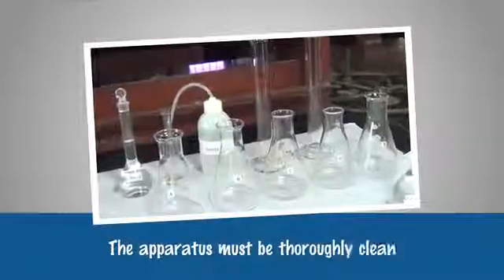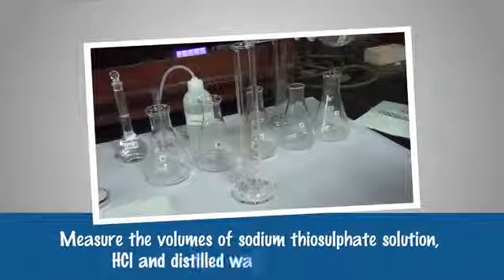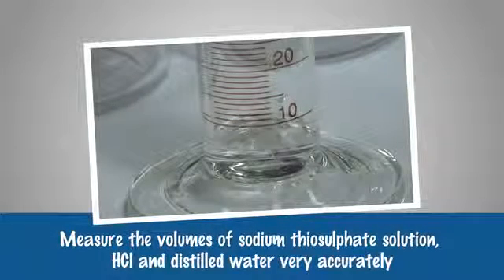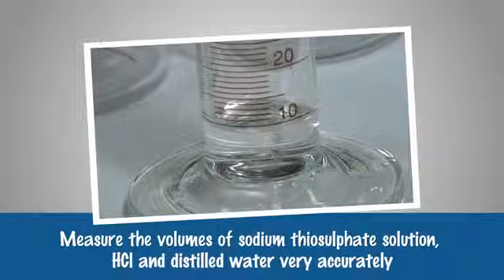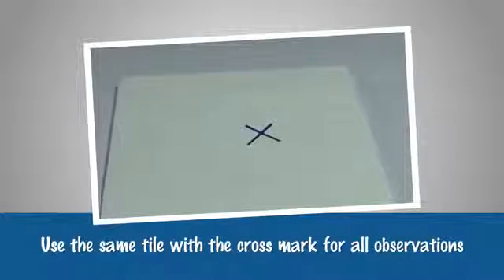Precautions: The apparatus must be thoroughly clean. Measure the volumes of sodium thiosulphate solution, HCl and distilled water very accurately. Use the same tile with a cross mark for all observations.